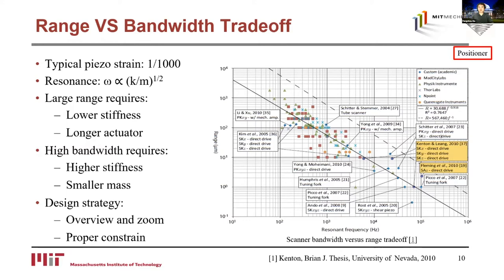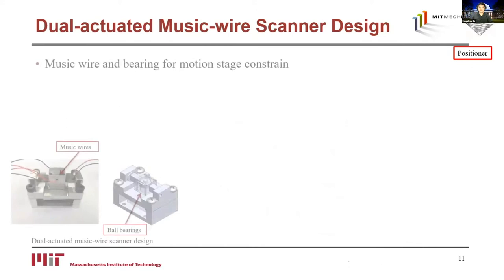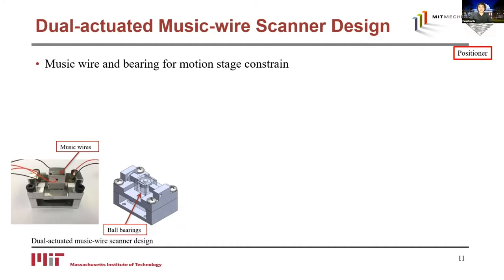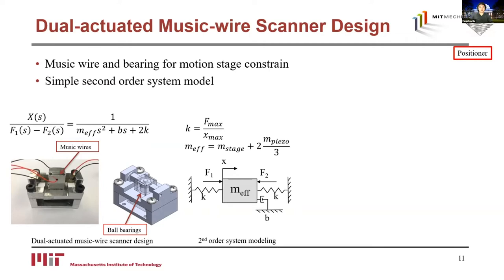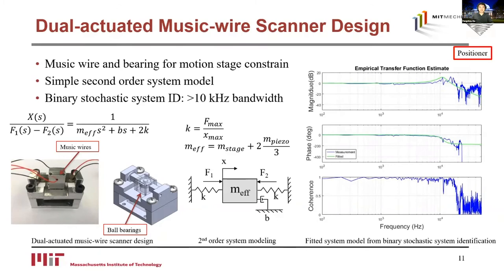The dual-actuated music wire scanner uses music wires and ball bearings to constrain a center stage in the out-of-plane z-direction, and two actuators to push the center stage from two directions to minimize drift from thermal expansion in the x-direction. A simple second-order system model captures the linear dynamics. Using binary stochastic system identification, we achieved a 10 kHz in-plane scanner bandwidth and over 100 kHz out-of-plane scan bandwidth. This scanner is stacked on a commercial large-range 100-micron scanner for overview-and-zoom imaging, and is used in the versatile sample scan AFM.